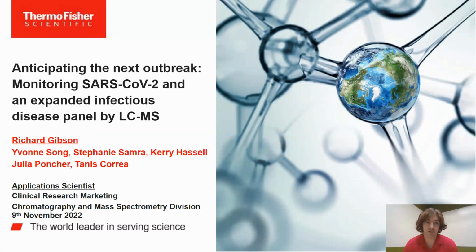Hi, I'm Richard Gibson, and I'm an application scientist for Thermo Fisher Scientific out in San Jose, California. And I'd like to talk to you today about anticipating the next outbreak, how we monitored SARS-CoV-2 and developed an expanded infectious disease panel utilizing LCMS.